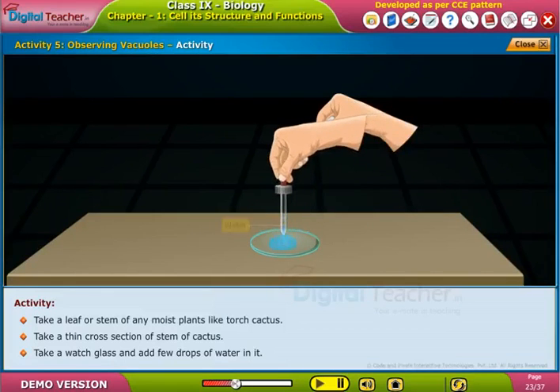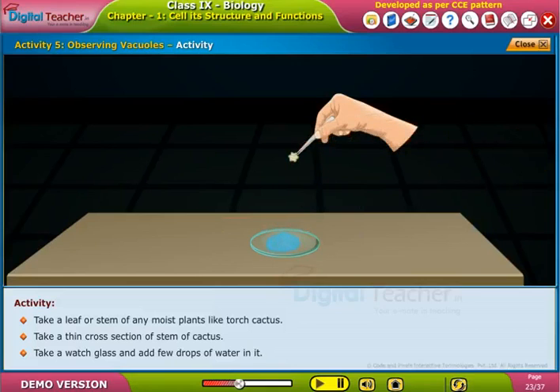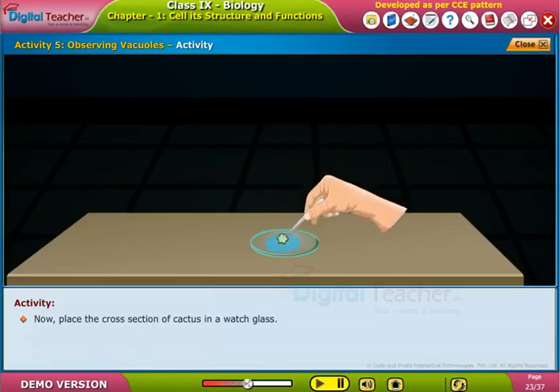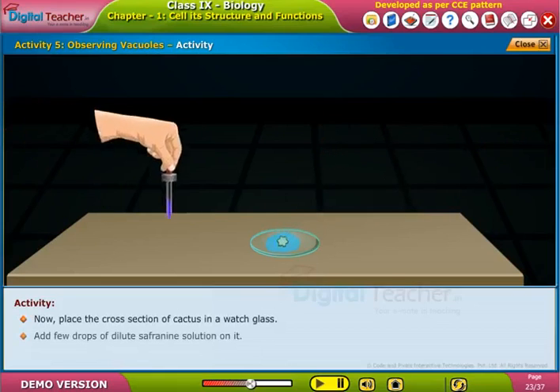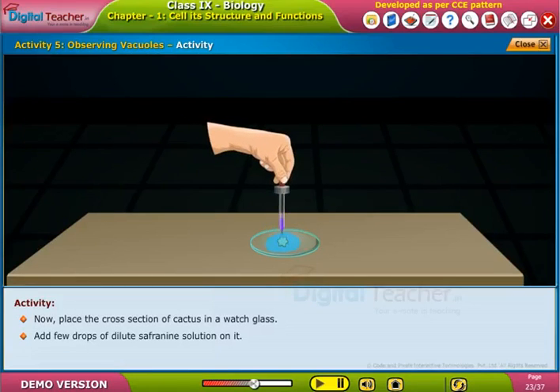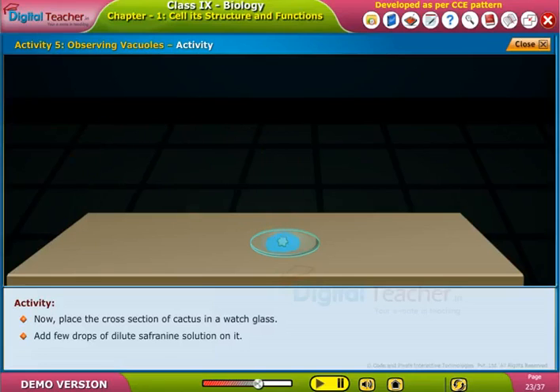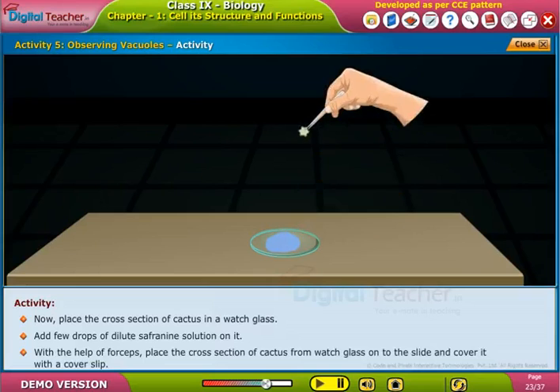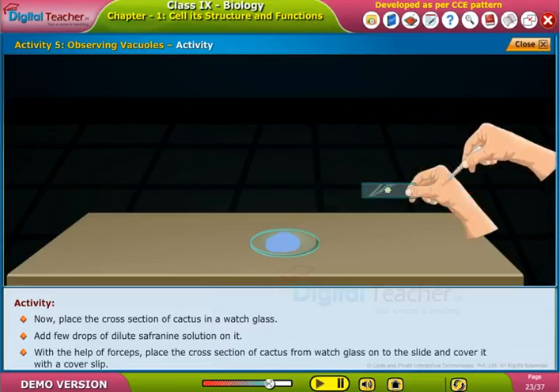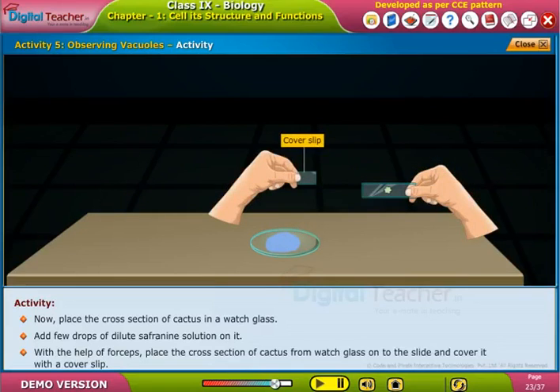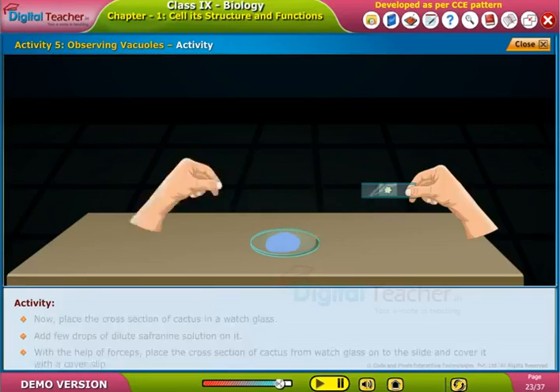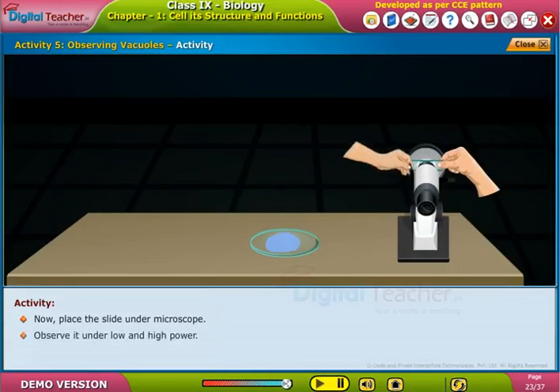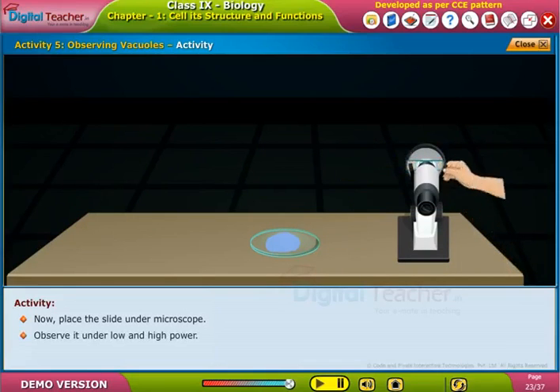Now place the cross-section of cactus in the watch glass and add a few drops of dilute safranine solution on it. With the help of forceps, place the cross-section of cactus from the watch glass onto the slide and cover it with a cover slip.